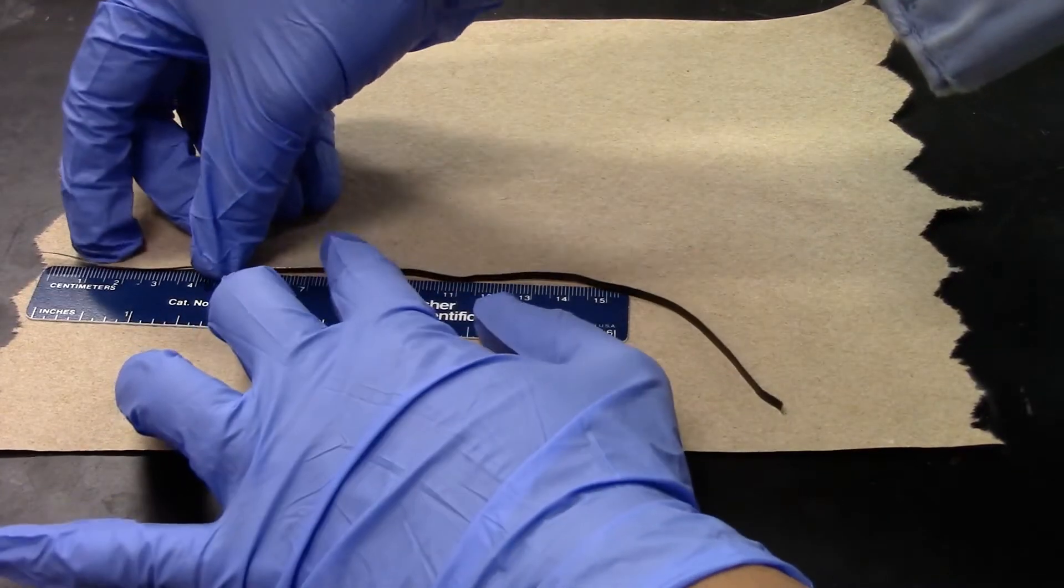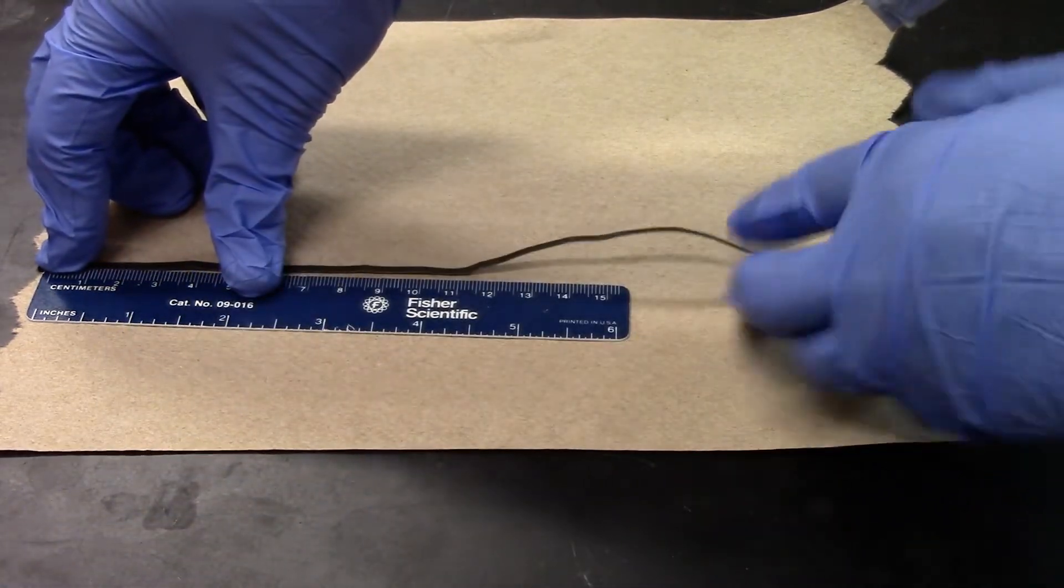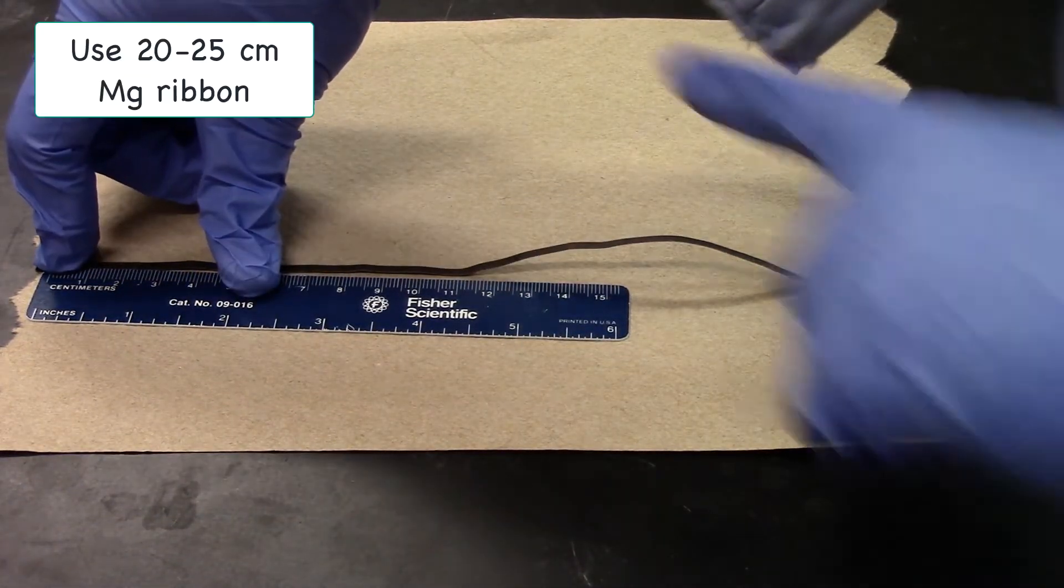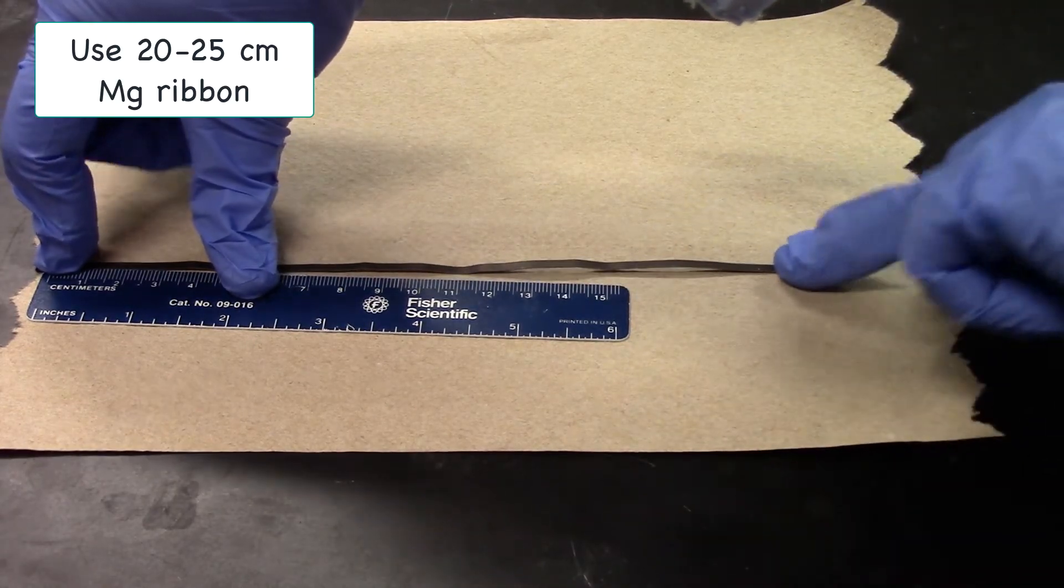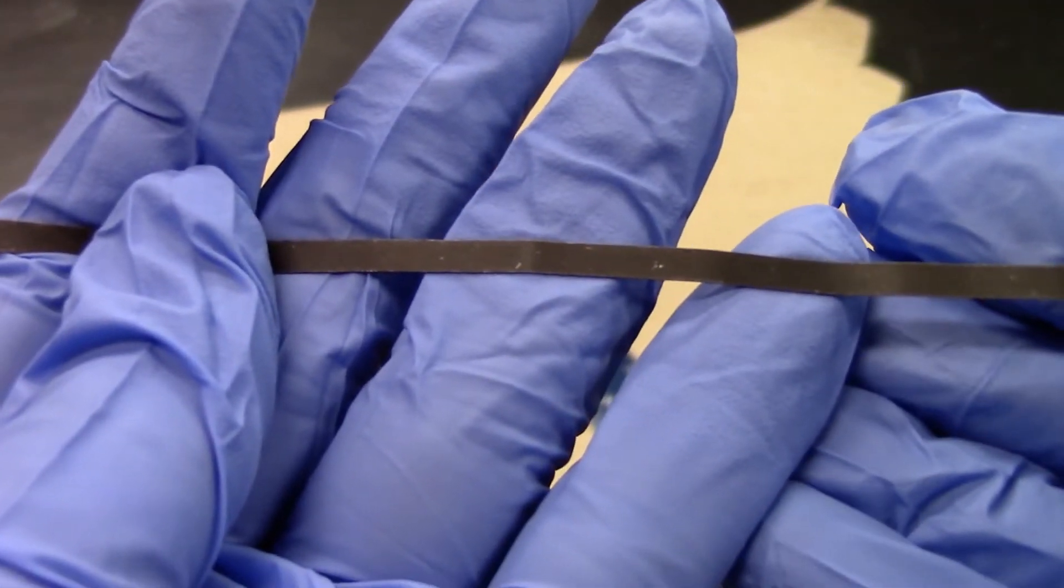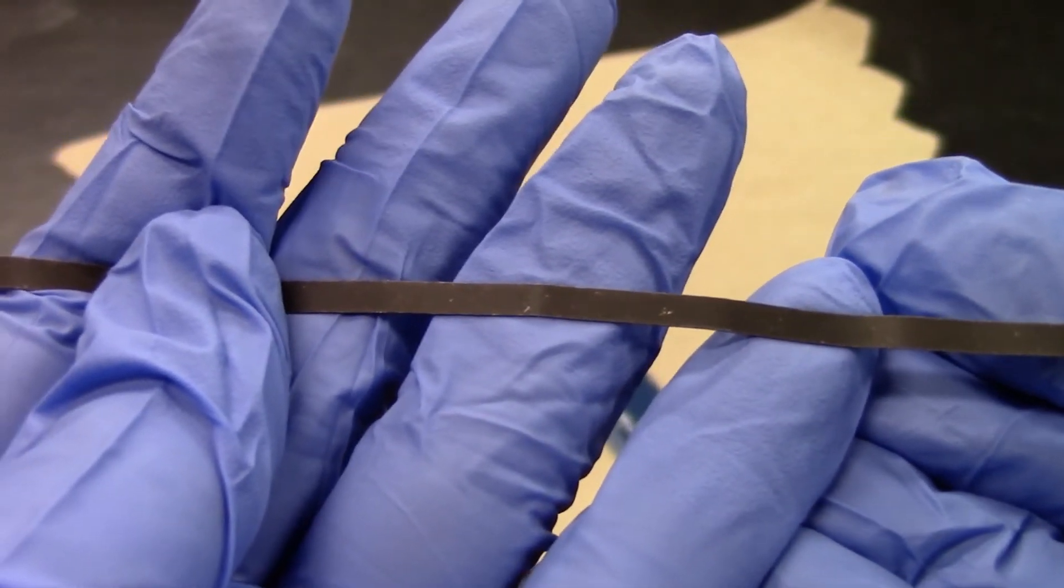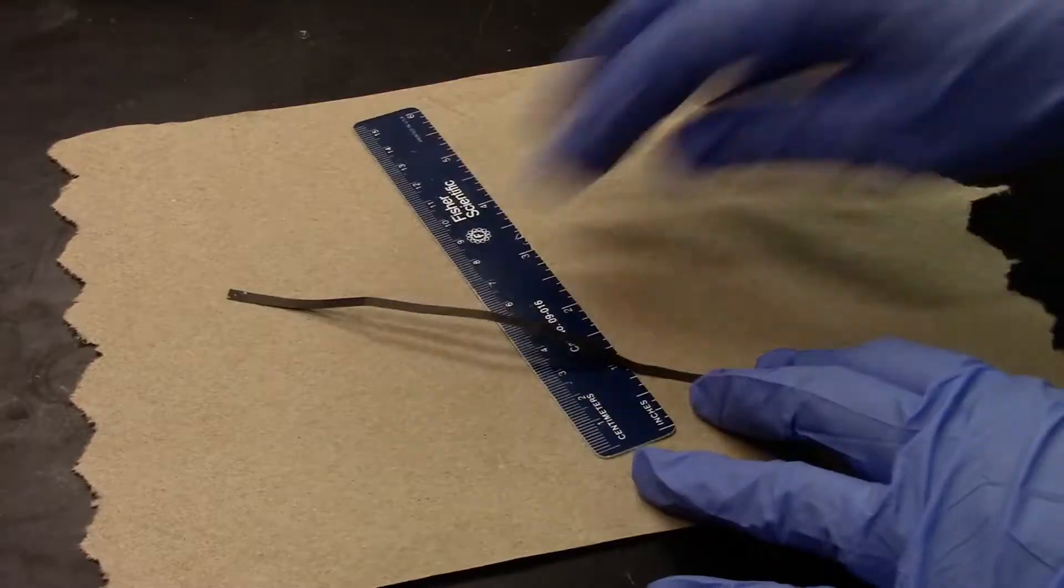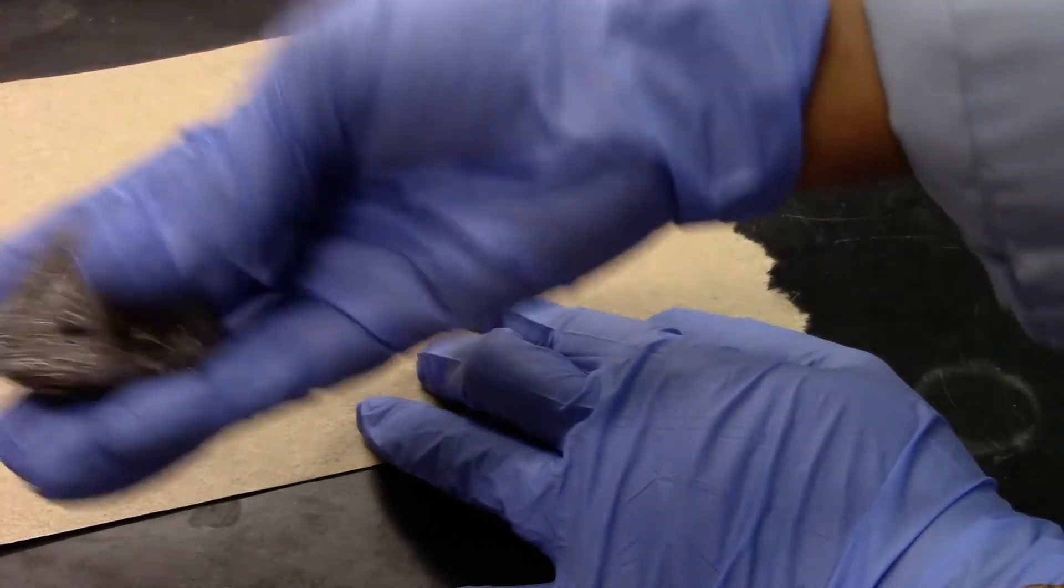The magnesium ribbon is a little longer than the ruler. This should be a good length for the reaction. If you take a close look, the magnesium has a grey coating on top which is the oxide coating. I will clean this with a steel wool.